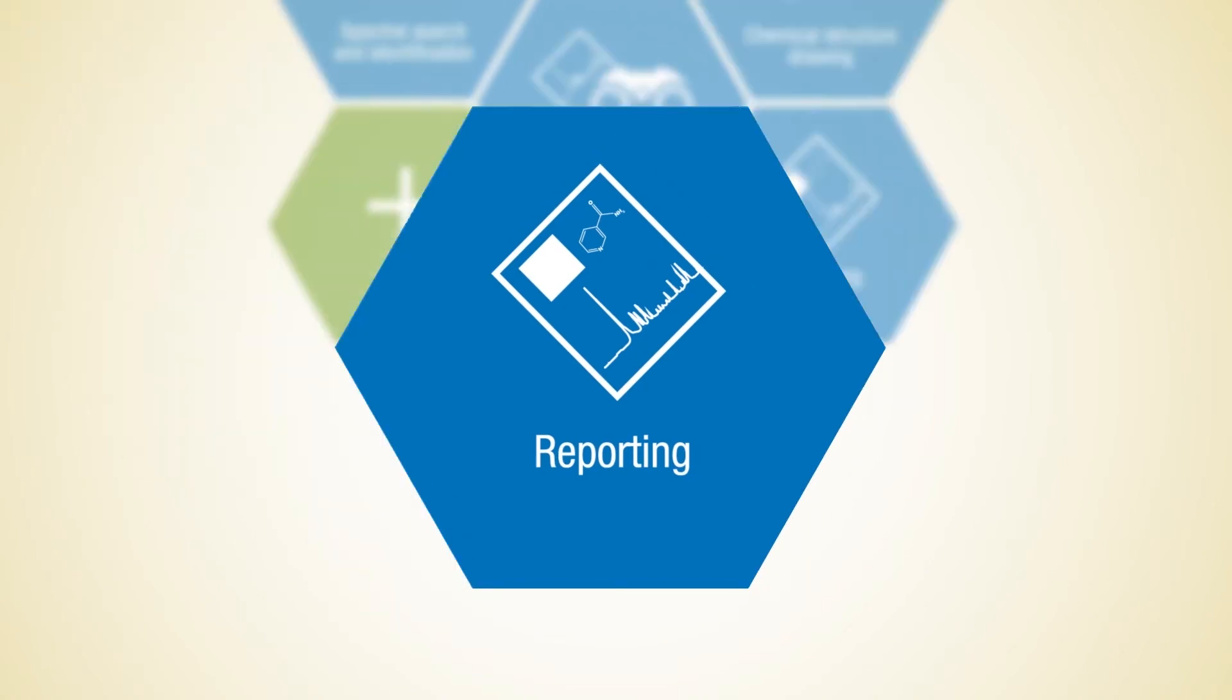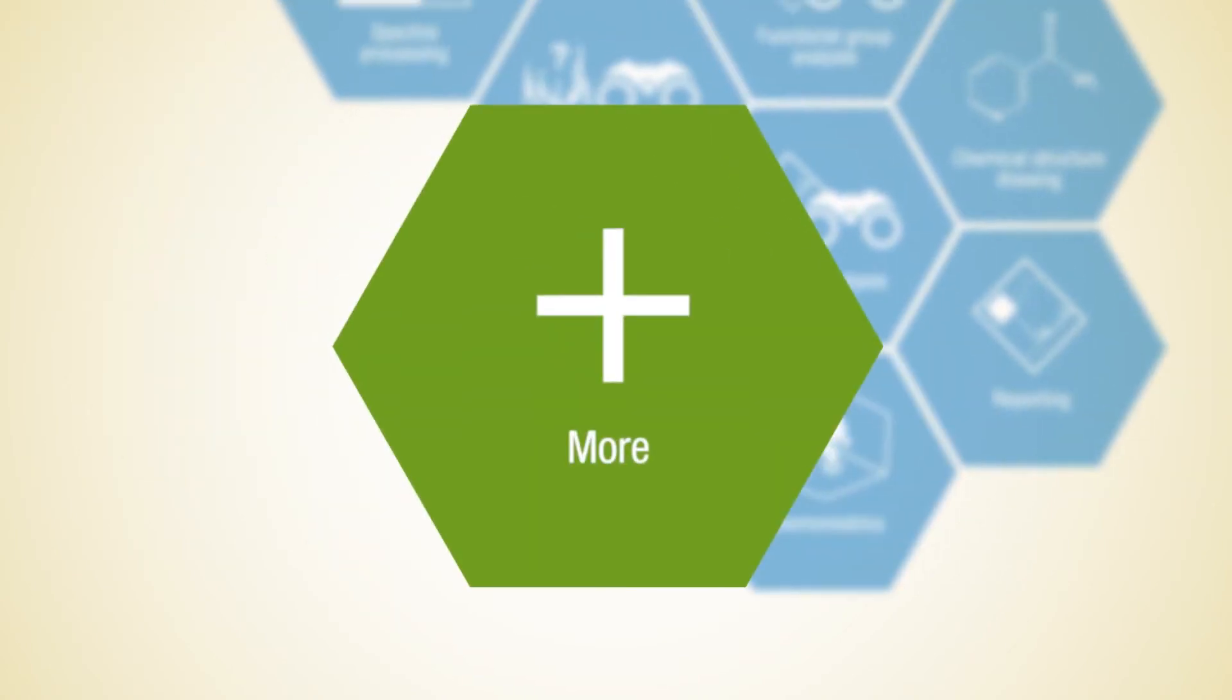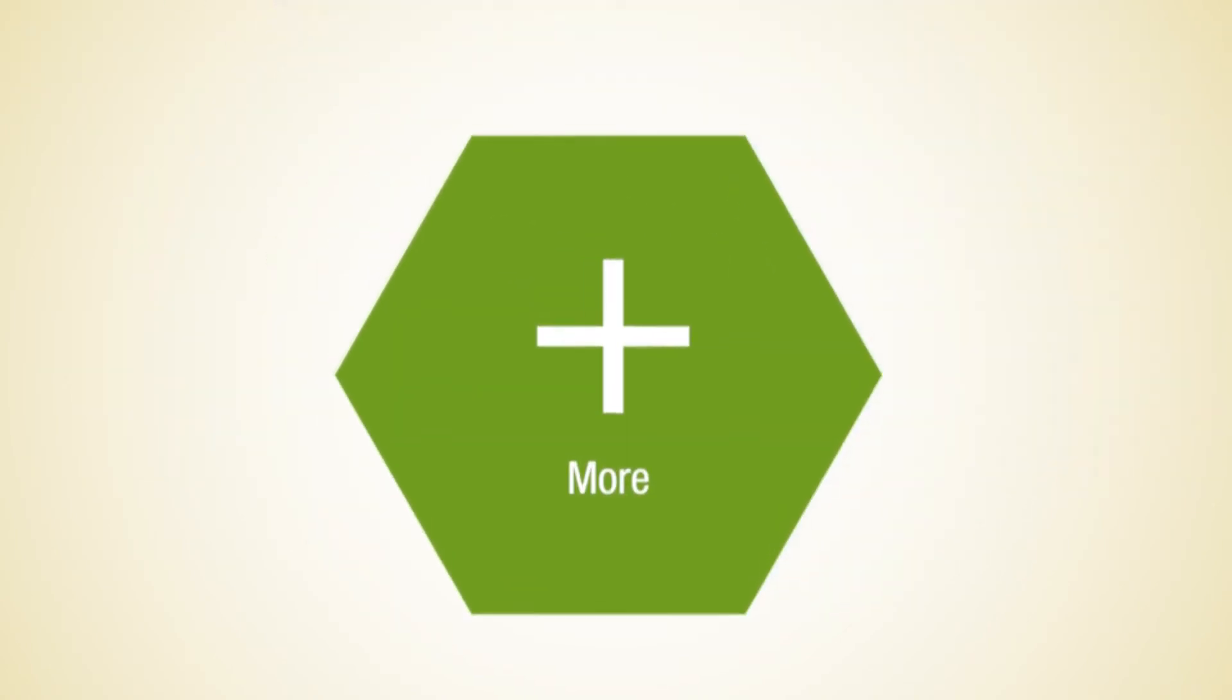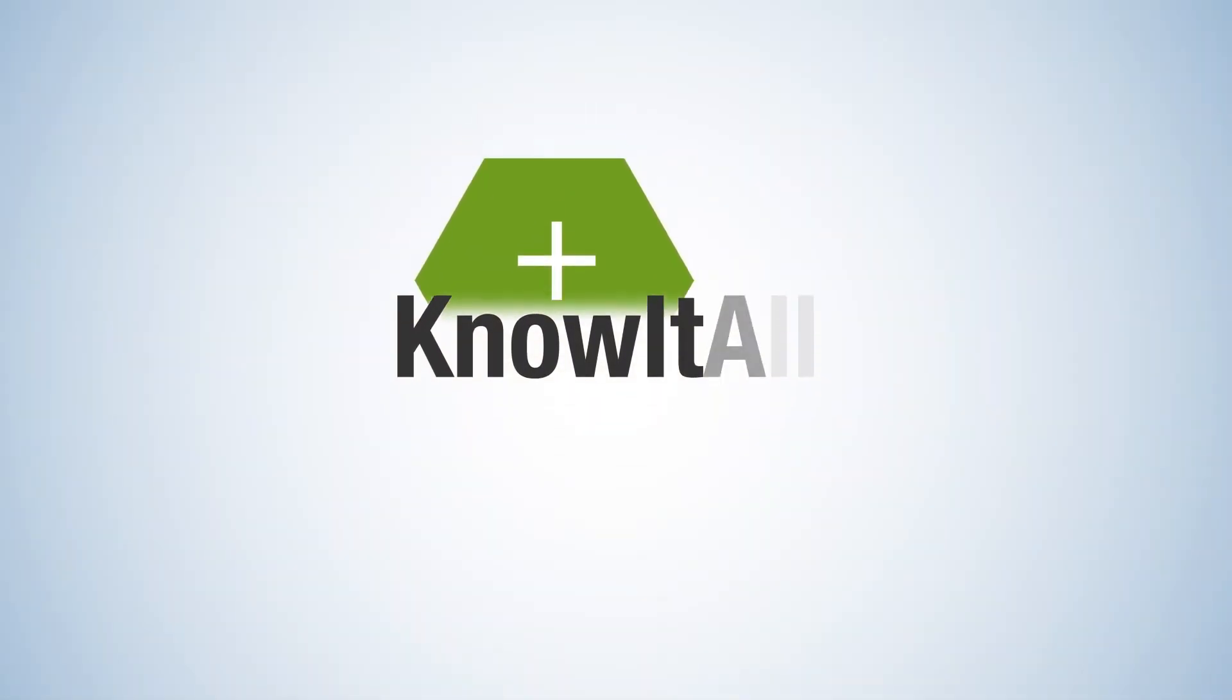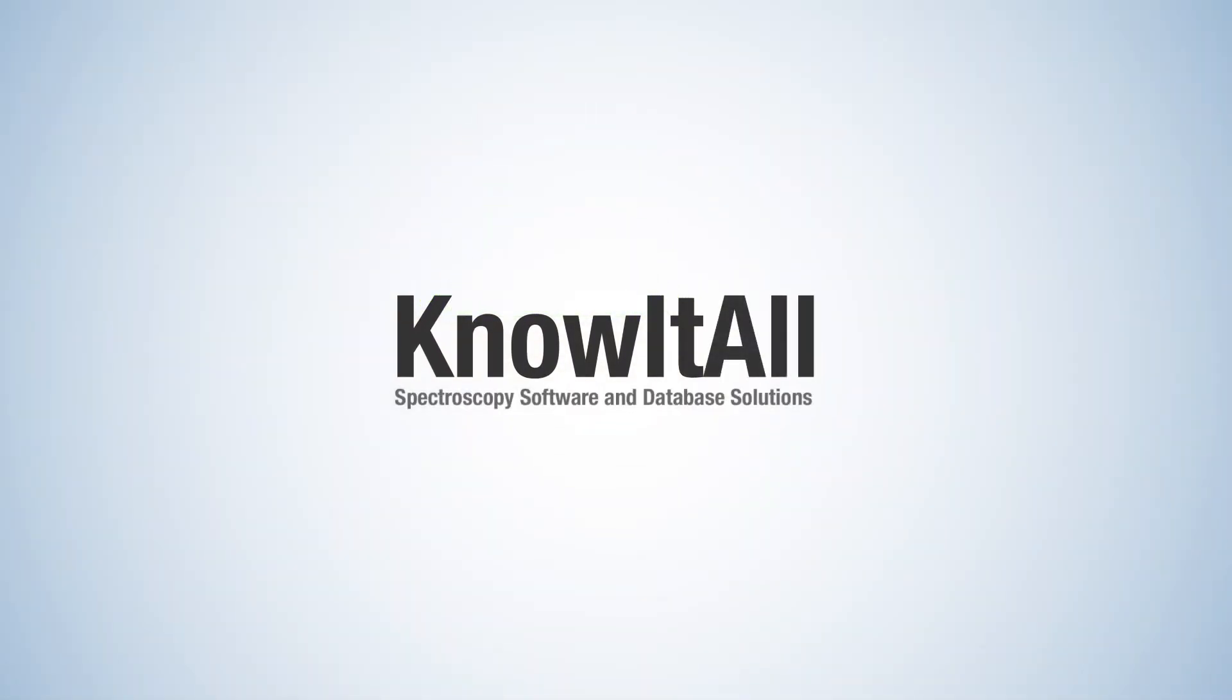And many more. We continually add spectral intelligence to our software, which also includes patented tools not available in other spectroscopy packages.